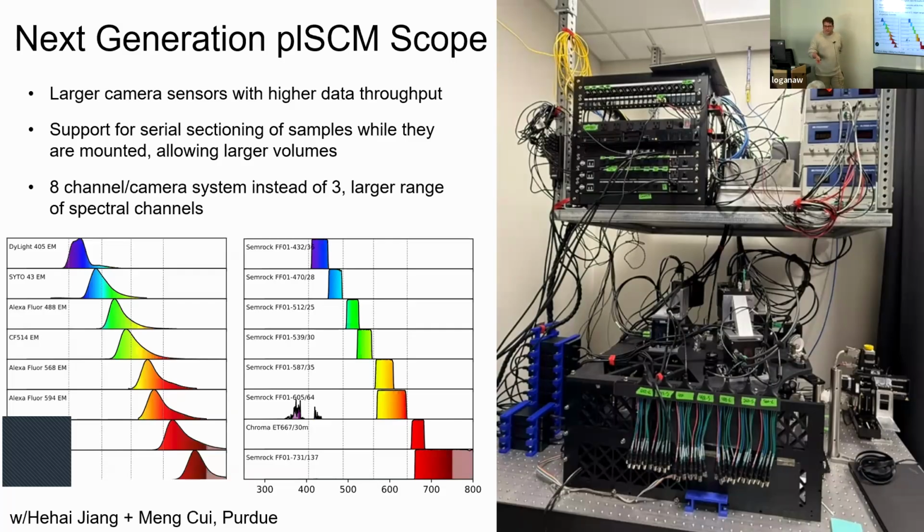And obviously, there are a lot of safety concerns because some of these lasers are multi-watt, so thousands of milliwatts. When you're aligning it, you don't run it at that power, but that's something you don't want to play with, safety wise. So that's one challenge, but it's not too bad.